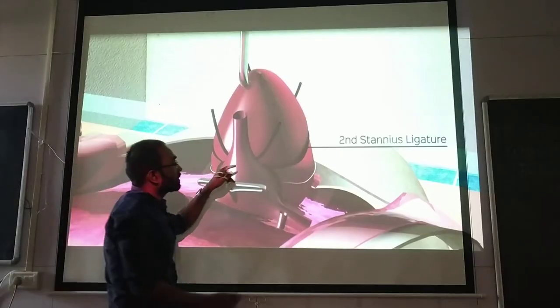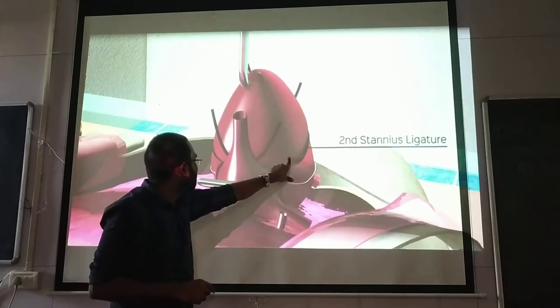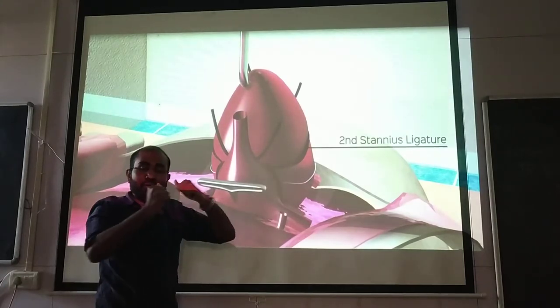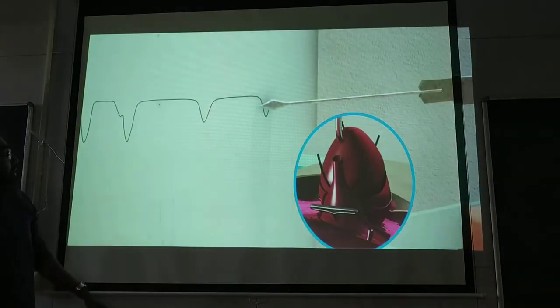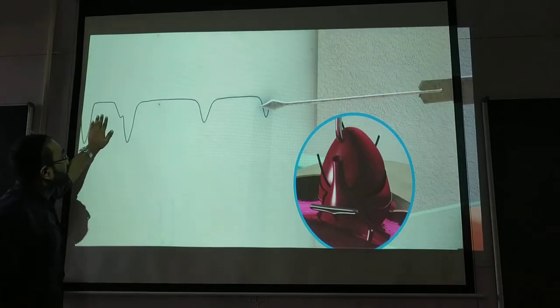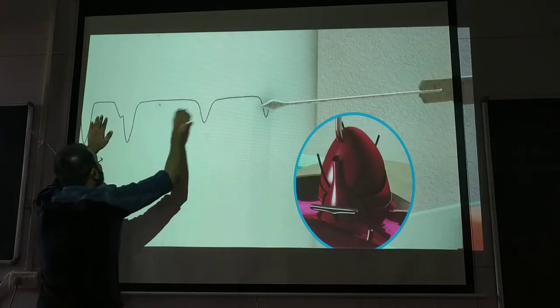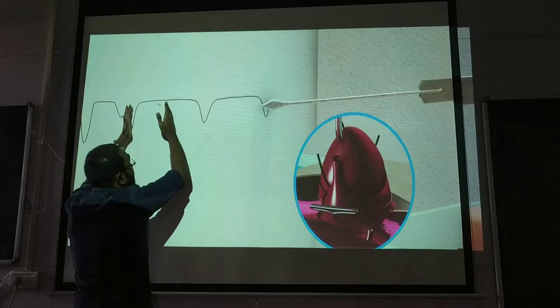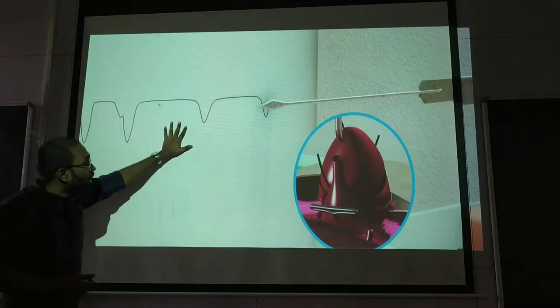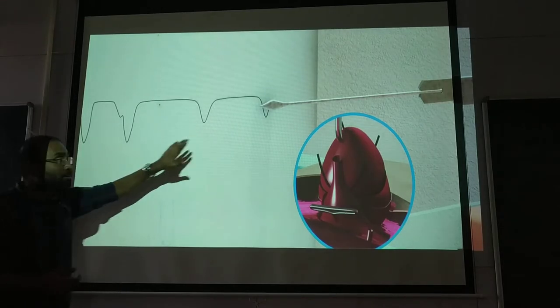Then we have given a second ligature at the atria–ventricle junction. After the second ligature, the force of contraction is further reduced and the heart rate is also further reduced — the distance between beats is much more increased. So comparing the second ligature to the first ligature, both heart rate and force of contraction are much more decreased.